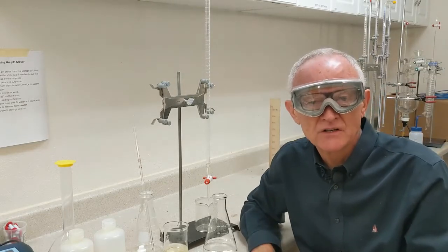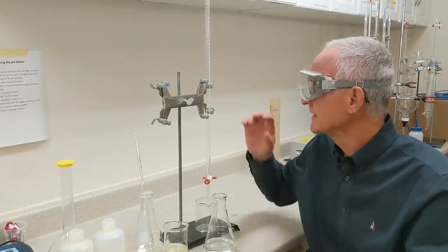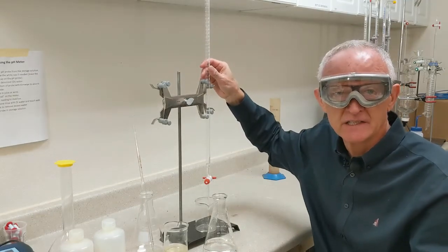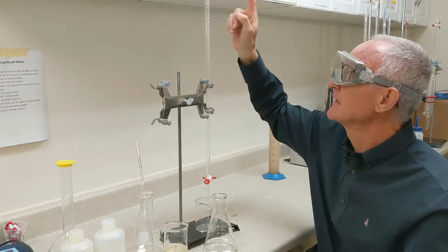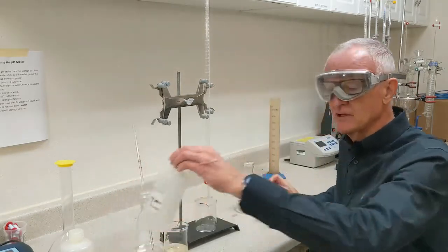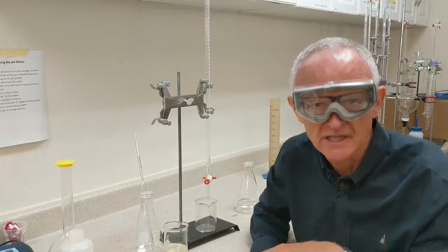Before I get started on the titration, I need to put in my burette 0.1 normal sodium hydroxide. So I've got a funnel at the top of the burette. I'm going to fill the burette with sodium hydroxide.